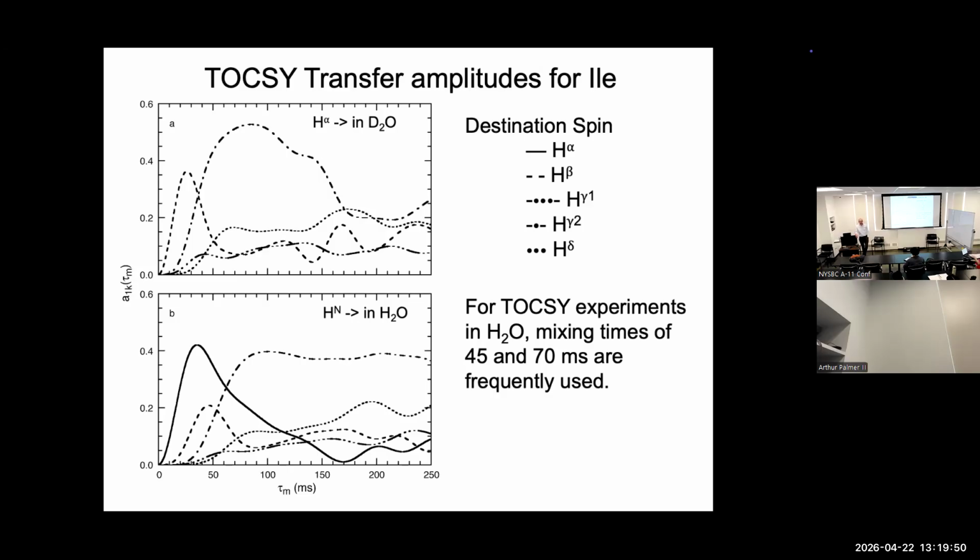Of course, that led to the idea that maybe you could design topology specific pulse sequences that would be more specific for an isoleucine than a leucine, for example, because of the different topology. And there are sequences like that. They've never become tremendously popular because there tends to be a lot of relaxation losses when you're trying to get something to be so specific. But maybe there's an opportunity for smart graduate students to revisit that.